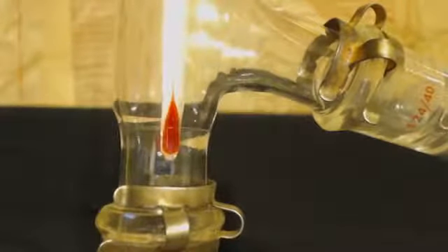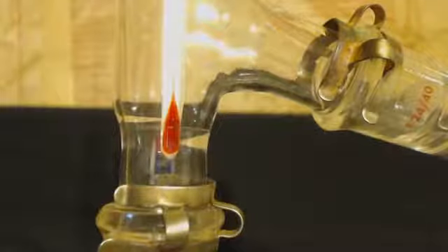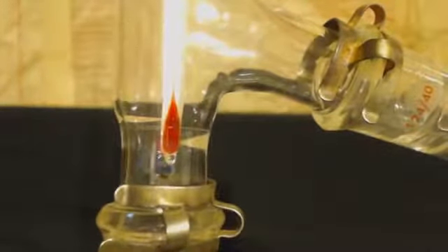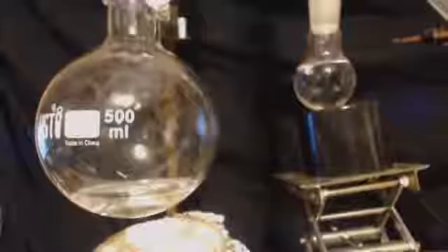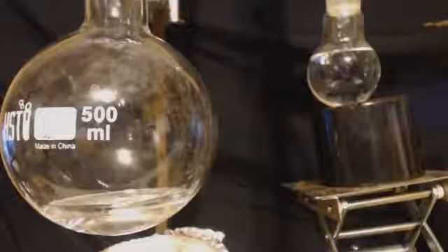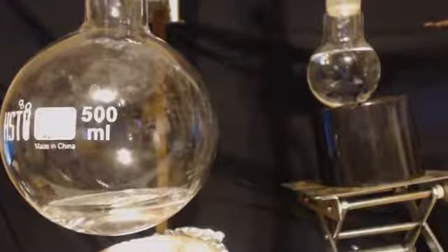Anyways, by the time I got done with the distillation, I had about 45 milliliters pure toluene. So I lost obviously some because I started out with 95 milliliters. But if you recall, we started out with 450 milliliters and we ended up with 45. You can see to the right, that's a 50 milliliter round bottom flask. It's almost full up, so that's about 45 milliliters.